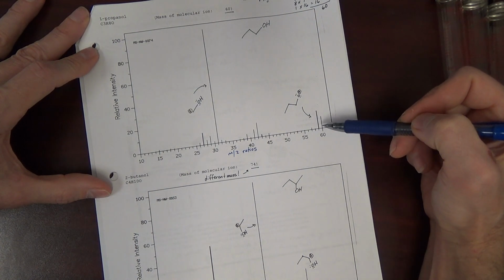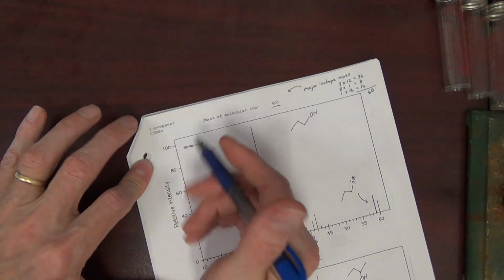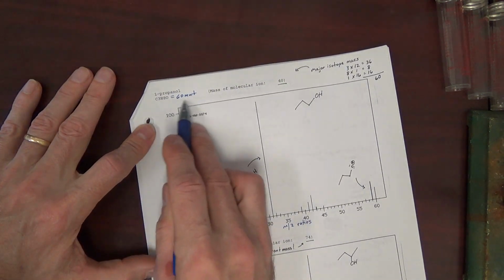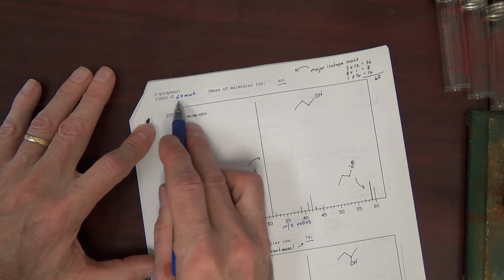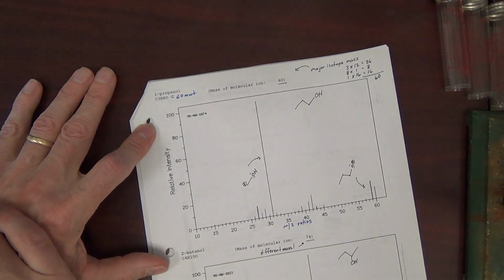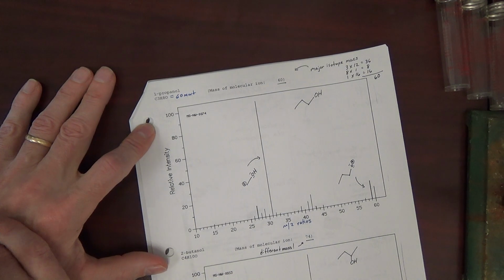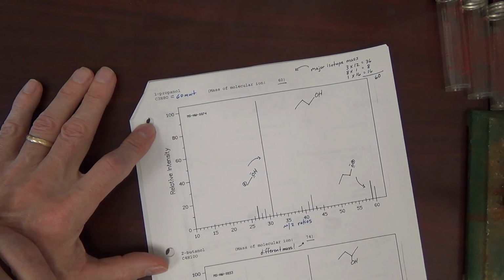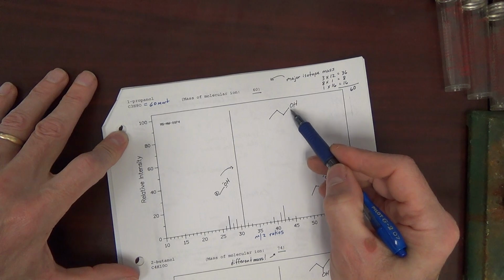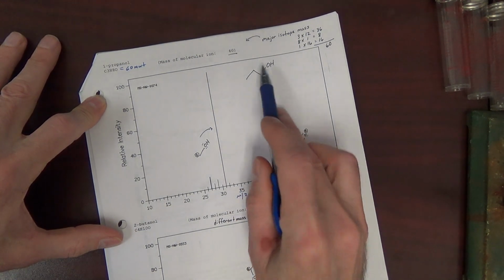Well, that's actually your molecular ion. If we look at this molecule, the molecular weight, C3H8O, equals 60. Now that is just a nominal mass, whole number mass. We're not going to be doing any decimal places when we do low resolution, standard mass spec. Near the end we will look at high resolution mass spec, and that's where we will consider the molecular weight out to 4 decimal places. But most of everything we'll be doing will be low res, nominal mass, and the mass of this is 60. And indeed, we're seeing a peak at 60 that corresponds to the mass of this molecule.